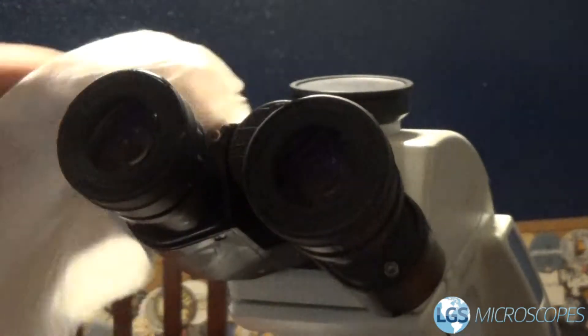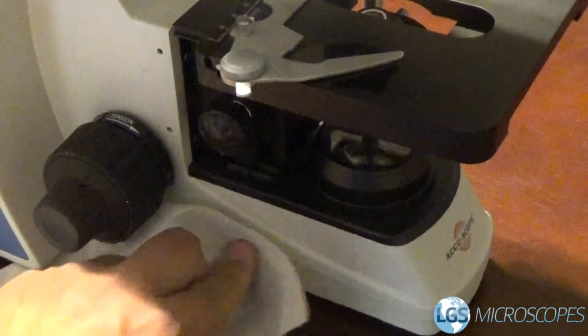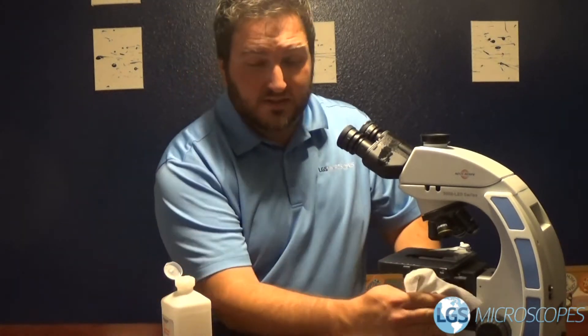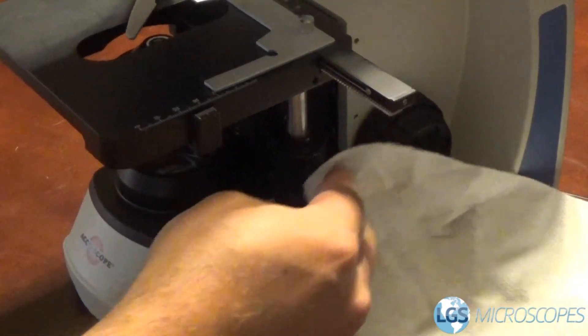And then just this whole piece here — the power switch, the brightness control, and then the knobs. Surprisingly you get a lot of immersion oil on the knobs. I find that a lot when we're out servicing at all different kinds of customers, so this also will help keep the immersion oil off.